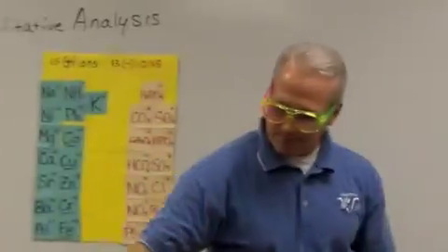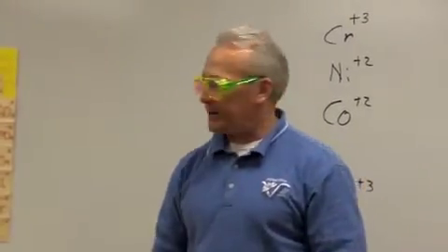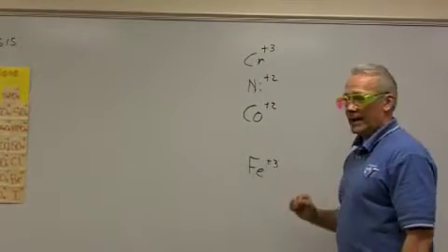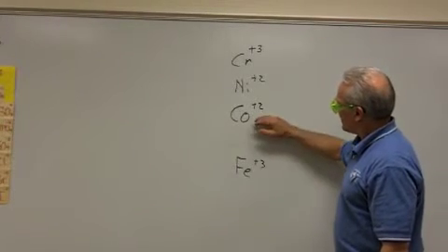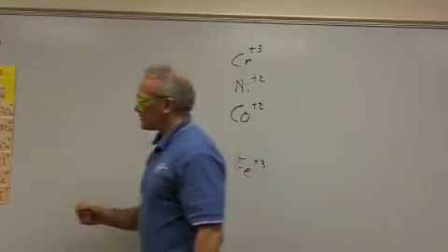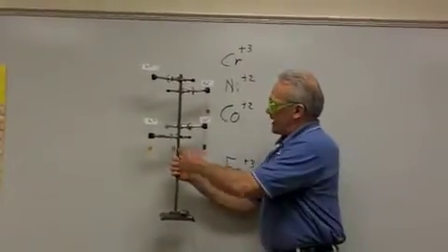Now afterwards, since we're talking about the hydroxide test with the iron, and we are down to these 4 ions that we think we might have for our positive ion, it would be logical to see if iron, cobalt, nickel, and chromium add sodium hydroxide to these. So what we have here are 4 test tubes, and they're labeled so we can see the colors of these now.